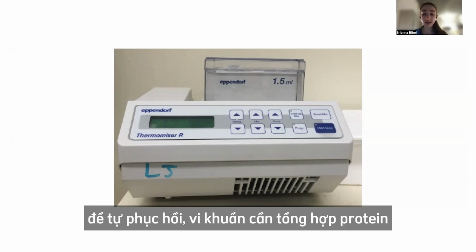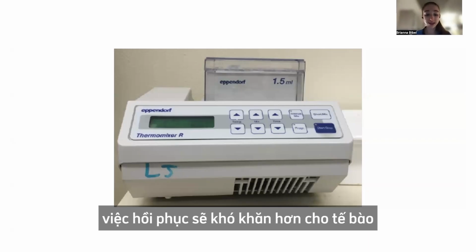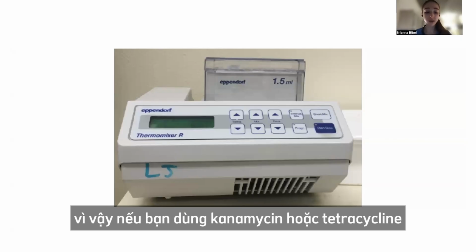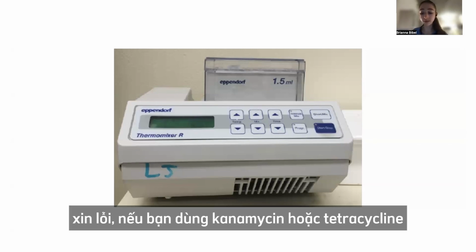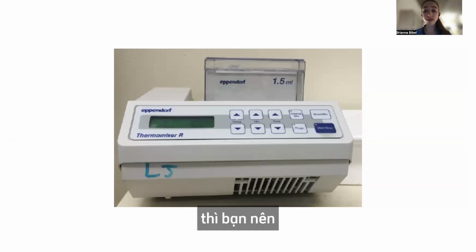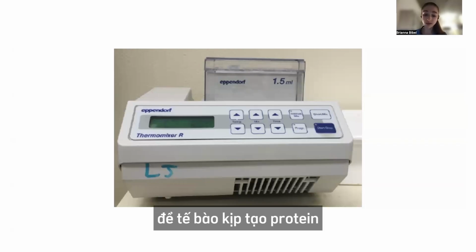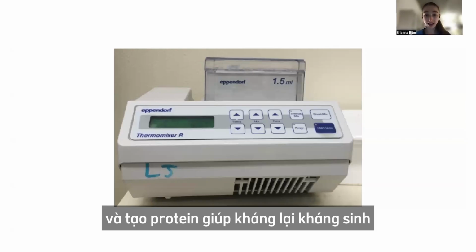In order to heal itself, the bacteria is going to have to make some proteins. Now, if your antibiotic is inhibiting protein making, that's going to make it harder for the bacteria to heal themselves. And so if you're using an antibiotic like kanamycin or tetracycline or chloramphenicol, something that's inhibiting the protein making, then you're going to want to give it an outgrowth of about an hour in order to allow it to make the proteins that it needs to heal itself, as well as to make the proteins to inhibit the antibiotics when you add them.